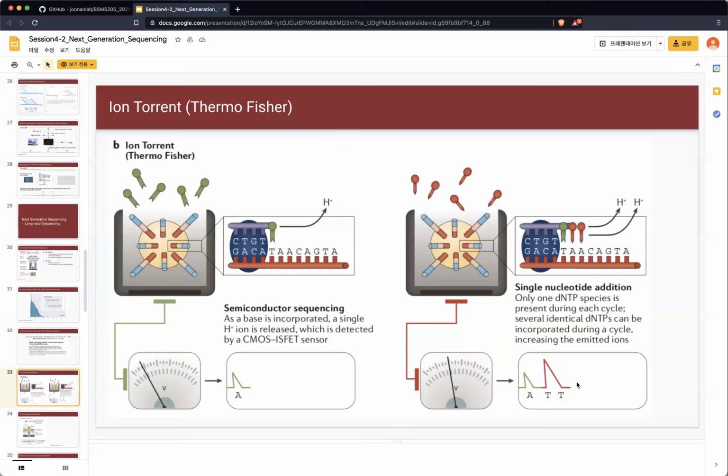Another problem compared to Illumina sequencing is a totally different aspect, more like computational science. For the computational process to develop, the platform has to be discussed on an open platform, right? With Illumina sequencing, once the data is generated, people develop algorithms and scripts in the open space.